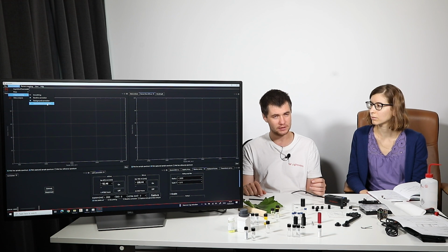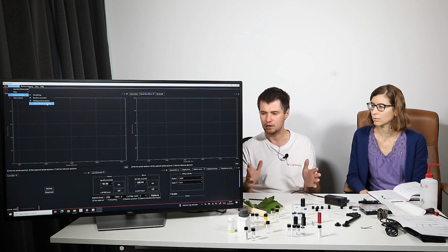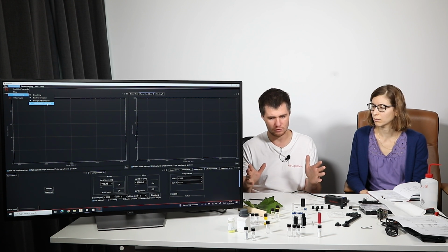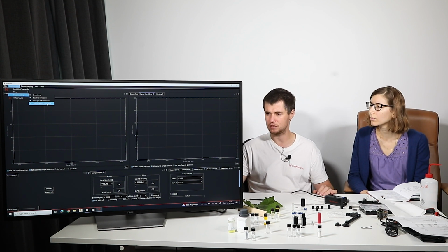Because you also compensate. This transmission was measured by black body source, like a tungsten lamp, and we also normalize at known temperature of the source, so we also normalize on quantum efficiency. So you have correct peak ratio for Raman spectra, and we can try that.